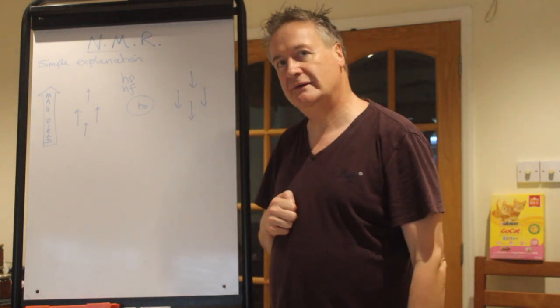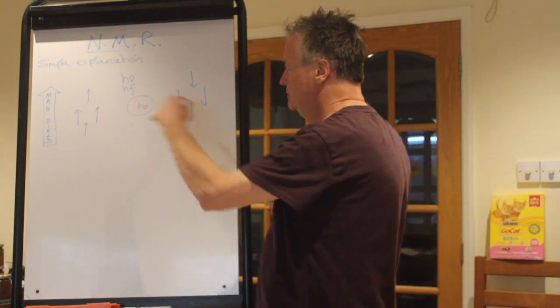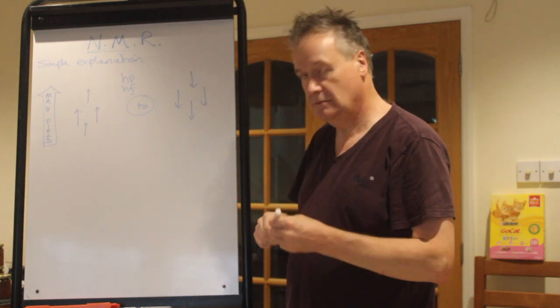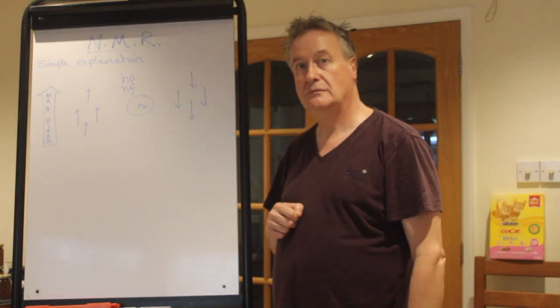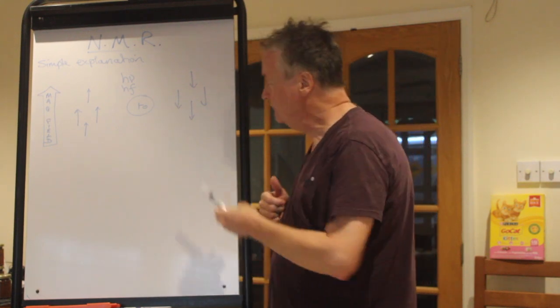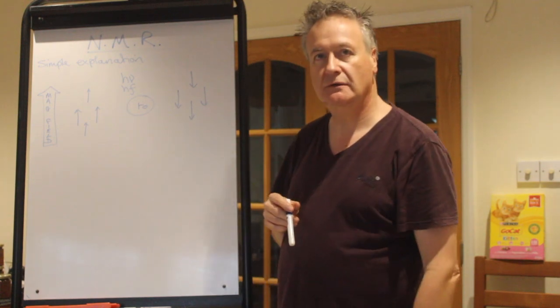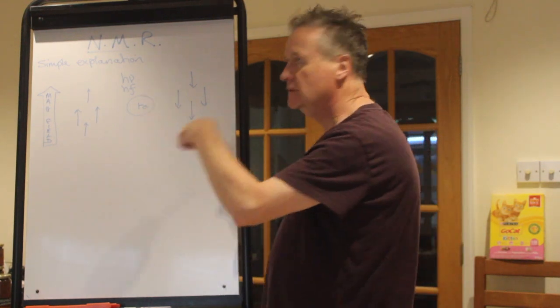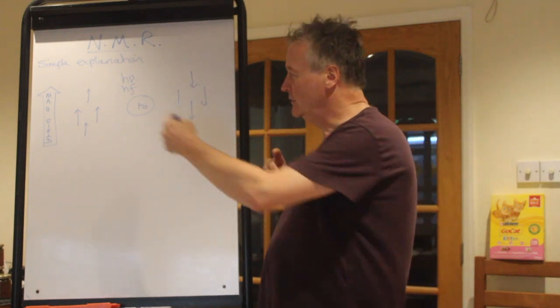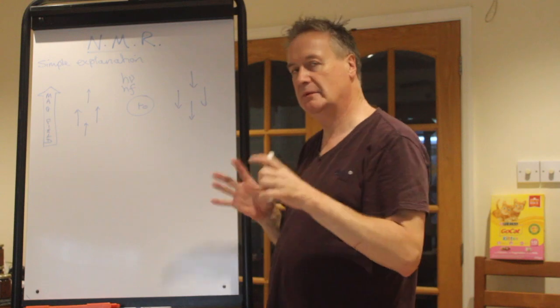And when you find out the energy that requires, that tells you something about the nucleus and what you've got around it. And then when you turn the magnetic field off, they'll flip round, or if you turn the energy off, they'll flip back. Now there is a real thing in the real way it works, is that you also look at when they flip back and they release the energy back again, but we don't get into that.